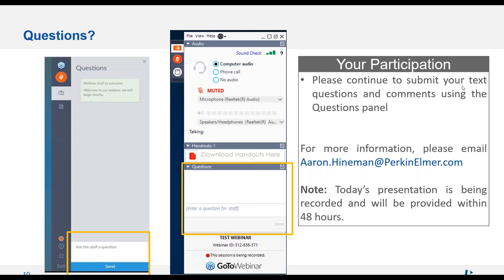And we do have some data from a multi-collector from a colleague of mine. We sent him the cuts that we had for the NexION, and he's like, I can't see anything. He got pretty much no signal. It wasn't that the standard deviations were through the roof, because he really was seeing blank levels, noise, no clear signals. And that was really what we wanted to do initially. That's what a lot of this work was based on: how low can you go and how fast can we get there?